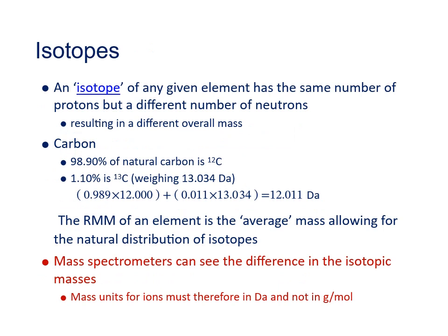Well, the reason for this discrepancy is the fact that most elements naturally occur as different isotopes. For example, carbon naturally occurs in two stable isotopes, carbon-12 and carbon-13. There's also an unstable isotope, the radioactive carbon-14 used in dating, but its levels are so low that we can normally ignore that.